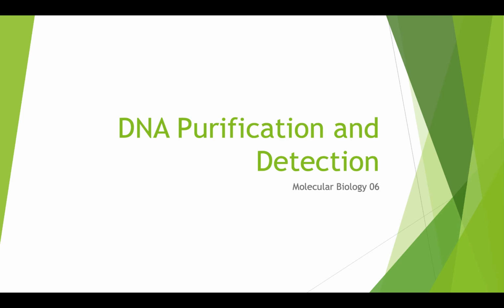The lecture or the seminar or whatever it is, it is about DNA purification and detection. It is quite possibly the integral lecture or seminar for this course. راح تشوفوا إنه the content of هاي المحاضرة هو أغلب إشي راح تشوفوه غالبا بكل العالم, wherever you go. The contents of this lecture include PCR, gel purification, and DNA extraction.